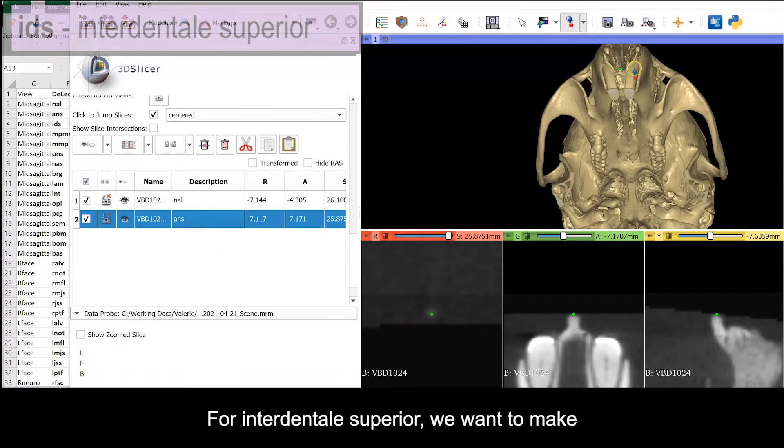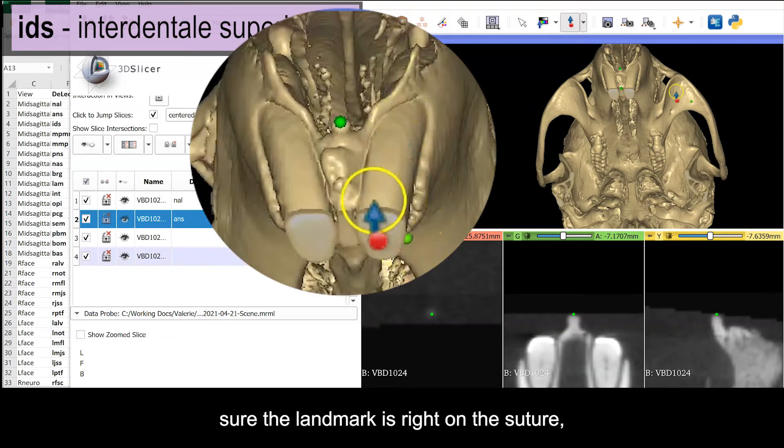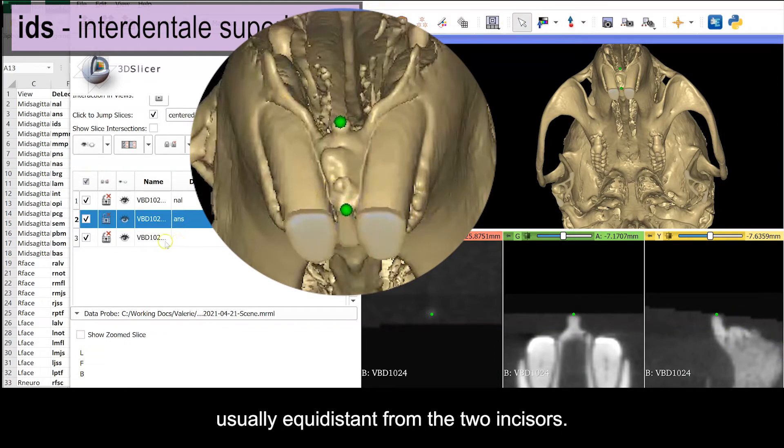For interdentale superior, we want to make sure the landmark is right on the suture, usually equidistant from the two incisors.